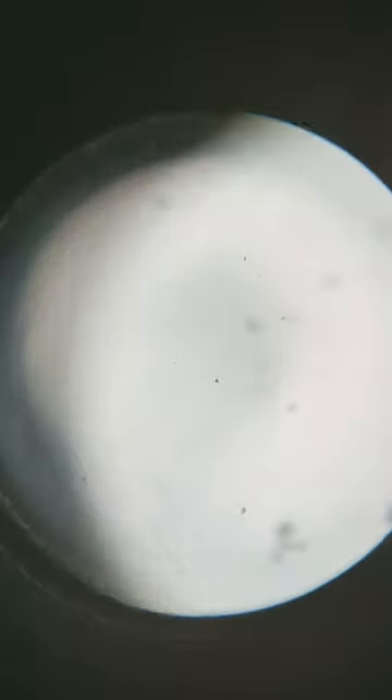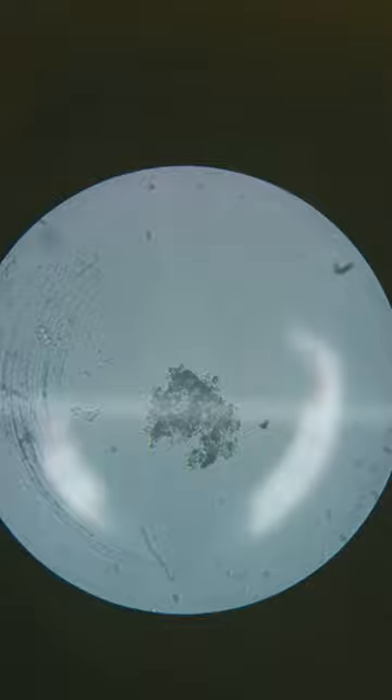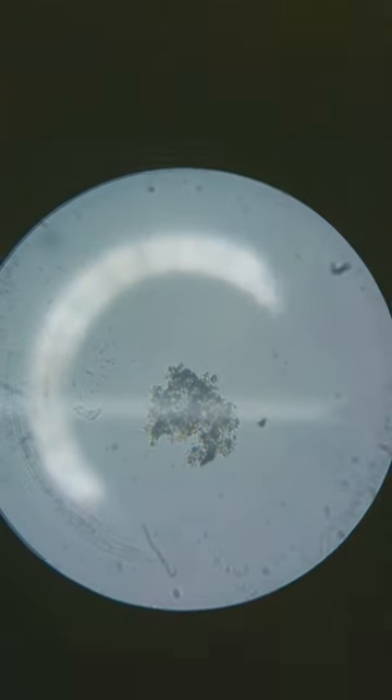I'm not seeing as much on the filtered side, but let's zoom in on that little bubble there in the middle. We're zoomed in — I mean 400 times.